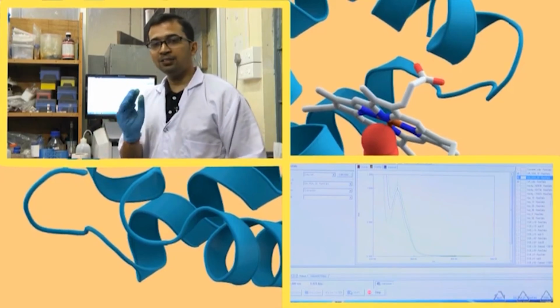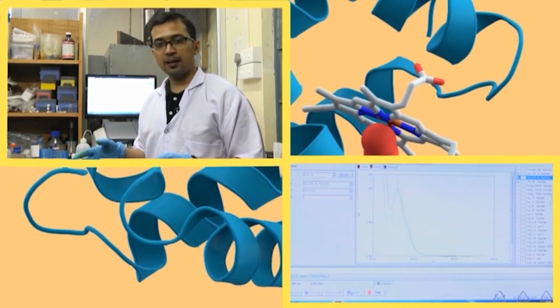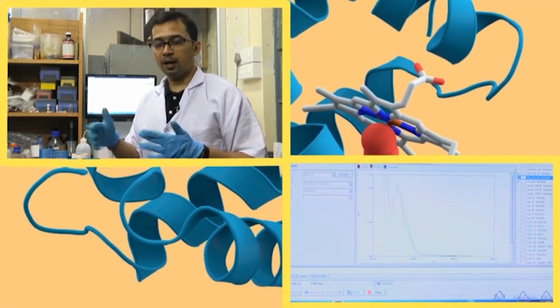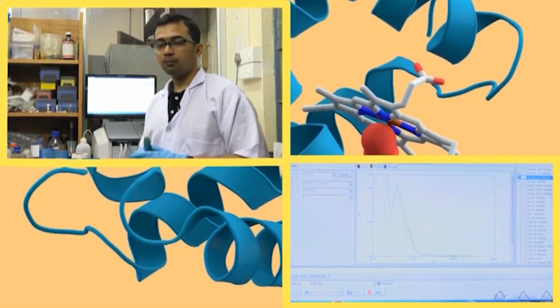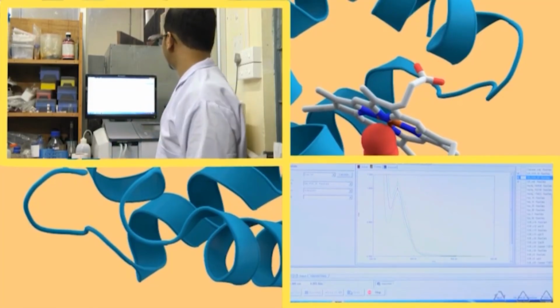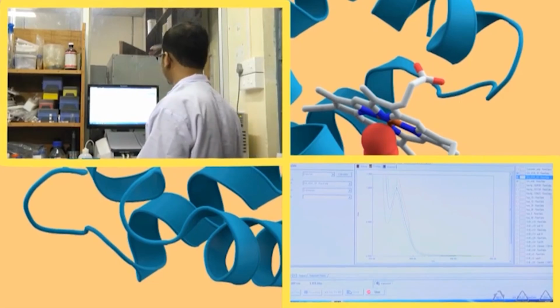So, if you take at least 8 to 10 points, from there you can easily leave out the 3-4 points which have errors, and then plot using 5 to 6 points. So, here again the absorbance is increasing.